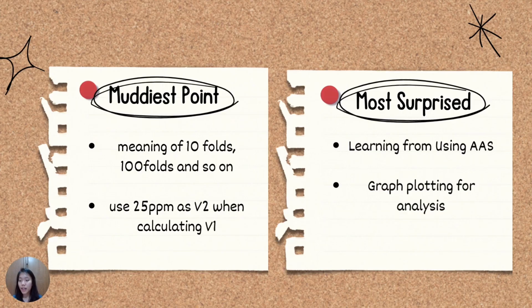The most confusing and unclear aspect of this practical was not understanding the meaning of tenfolds at the start of the experiment. I later realized that tenfolds refer to diluting the sample by a factor of 10. Another aspect that confused me was using 25 ppm as V2 to calculate the V1. In our case, we are diluting from a stock concentration of 25 ppm to a final volume, let's say 25 ml, assuming that is the volume of our flask.